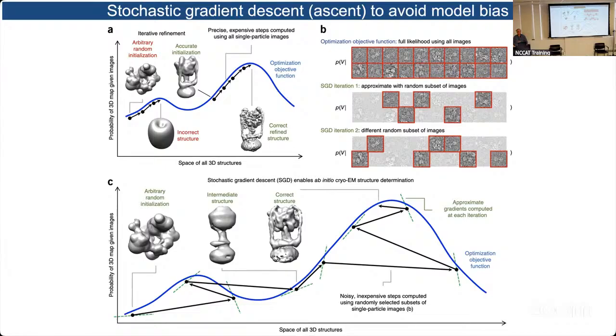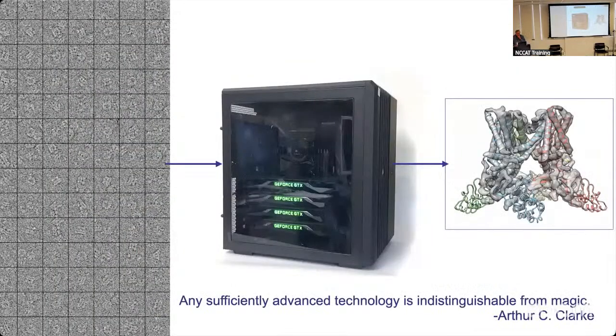And then at the final iterations, does it consider all of them, or does it consider the resolution that you're operating at and take that into account? So it then uses these fine steps, but only in the region where the coarse analysis said the best is supposed to be near this. Yeah. Okay. So anyway, I like to say this, that it's amazing that this works, and it's essentially magical.